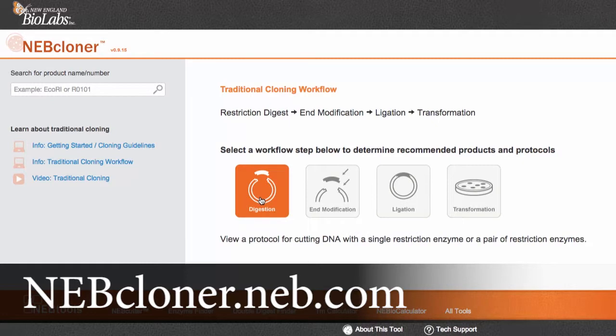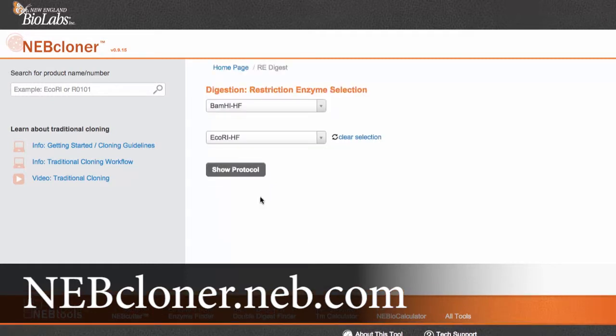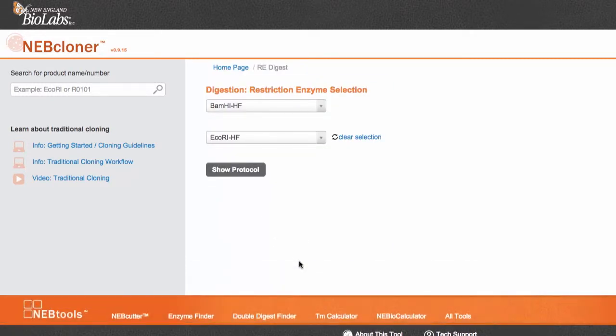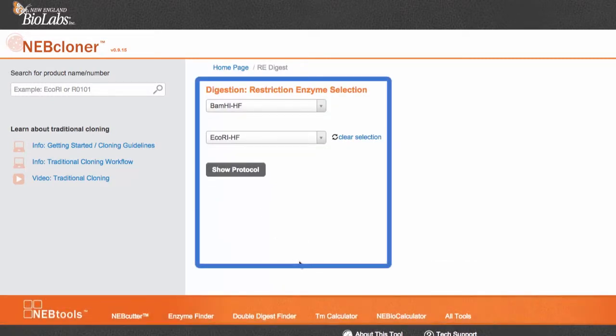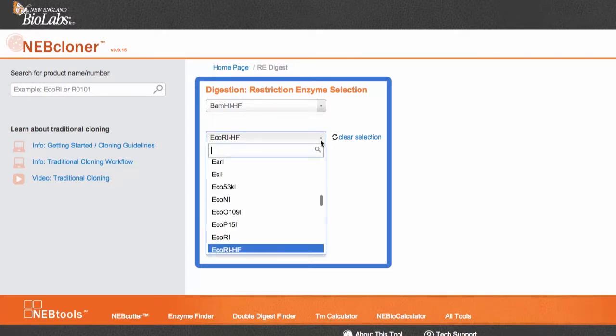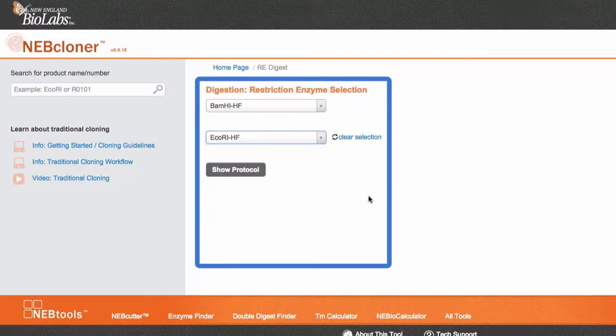Open up NEB Cloner and select Digestion. Next, choose the two enzymes that you would like to digest simultaneously. Please note that the second enzyme is optional. The tool will give you a protocol with just one enzyme as well. You can type the name of the enzyme or select it from the pull-down menu.